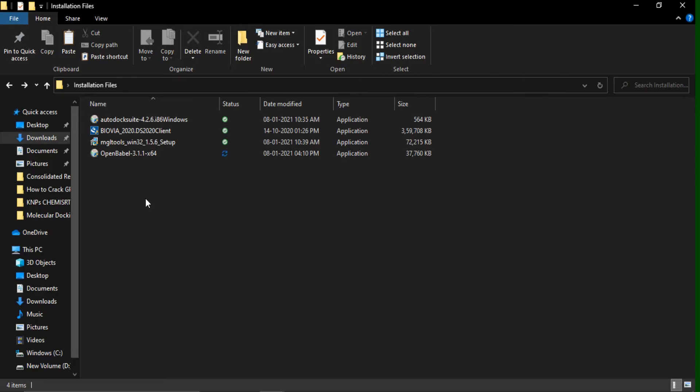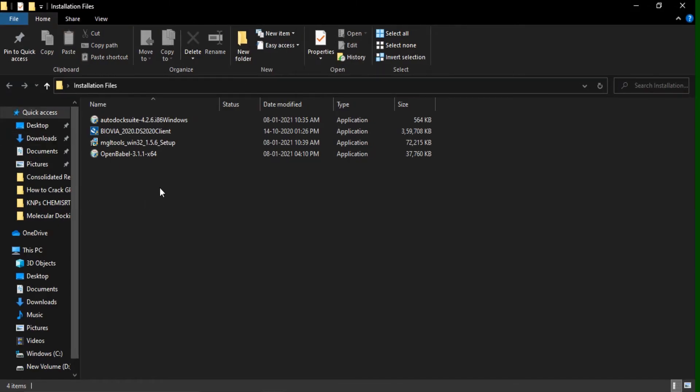And here you can see the installation files of all four. And now we are going to install one by one. First, we are going to install MGL Tools.